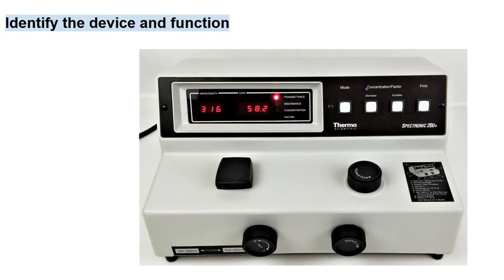And look at this huge device, which is called spectrophotometer. So I'm sure you remember this spectrophotometer, which we use to measure the absorbance and transmittance of a solution.